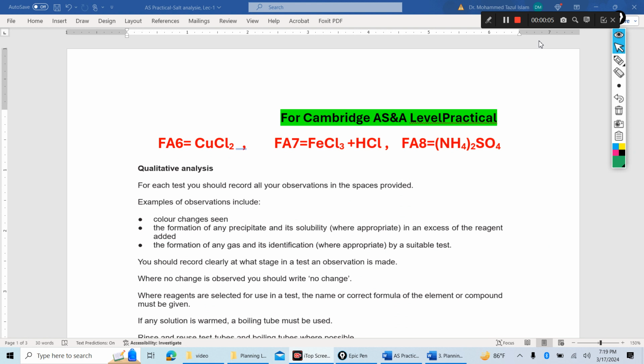Hello students, now I will discuss with you an important topic, salt analysis. This is important for the AS practical class. So you will follow this video properly. I think you will get maximum scores in salt analysis.